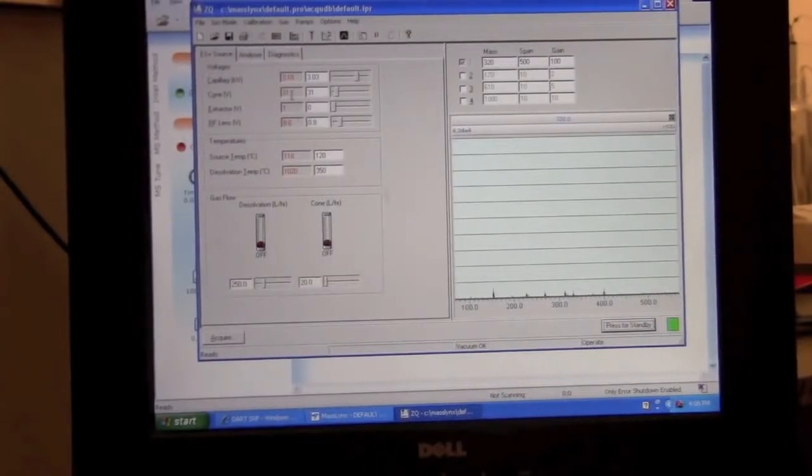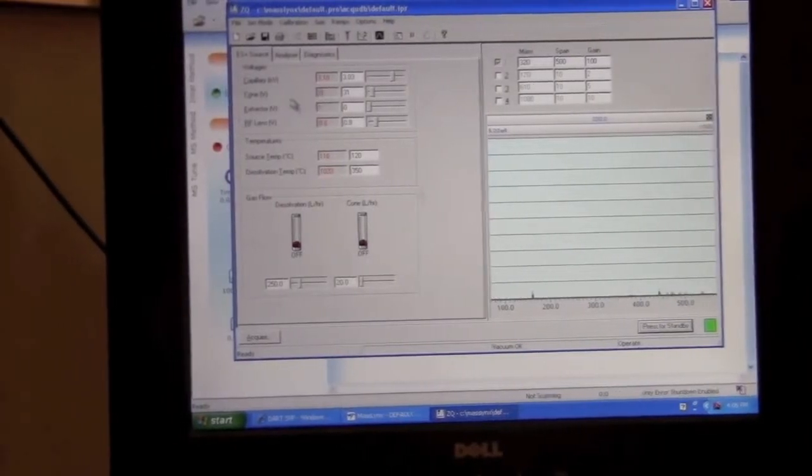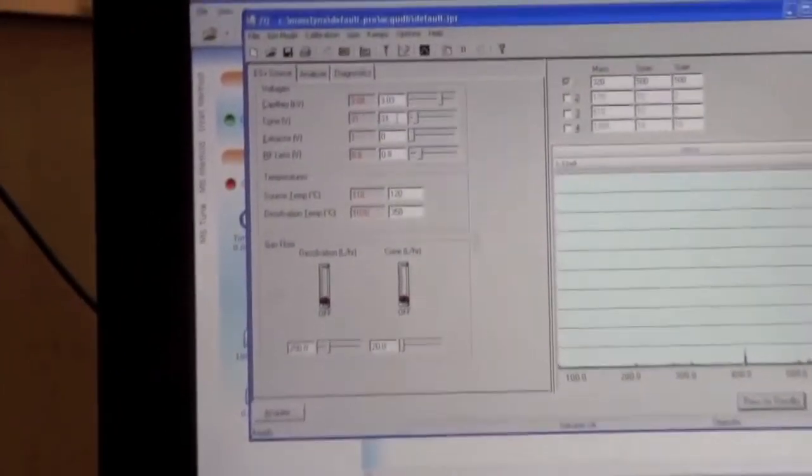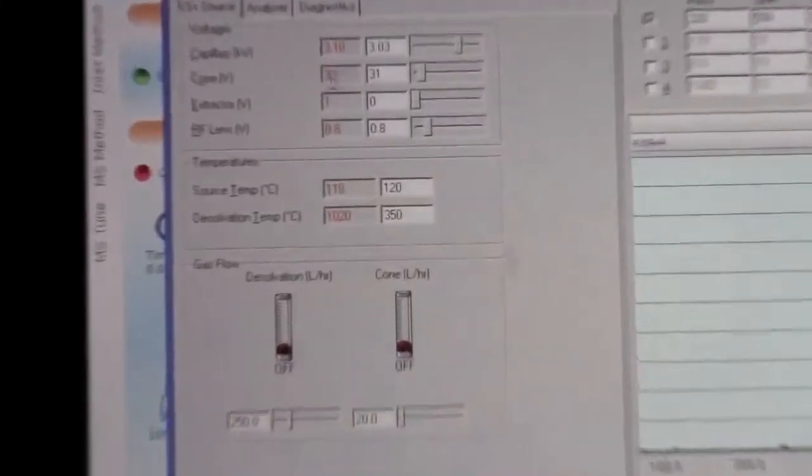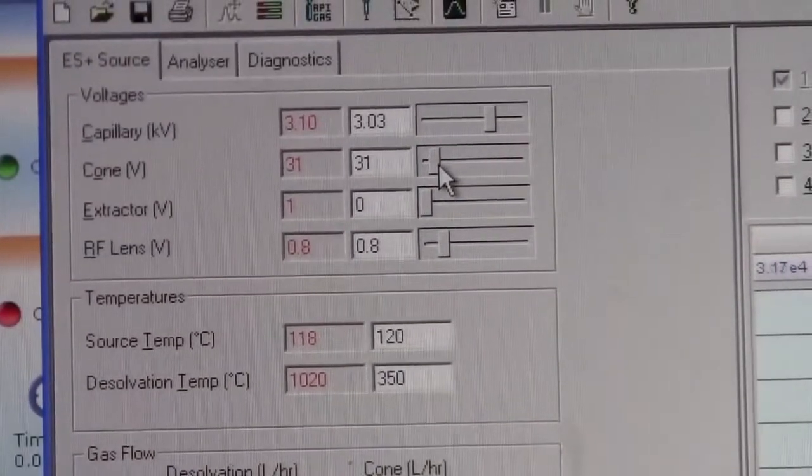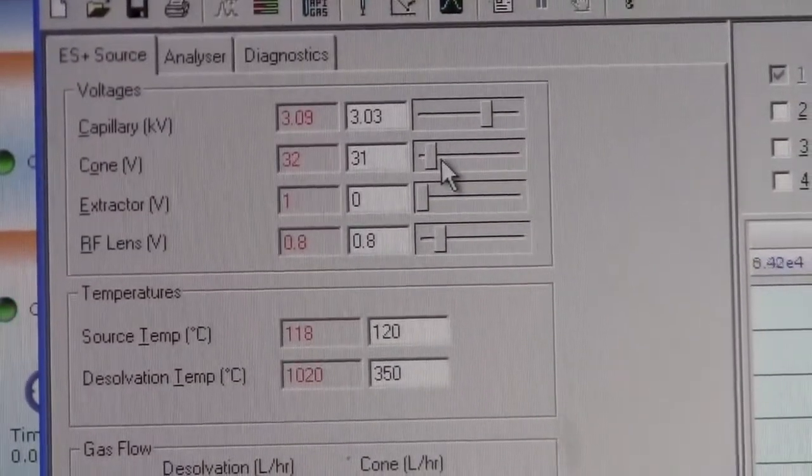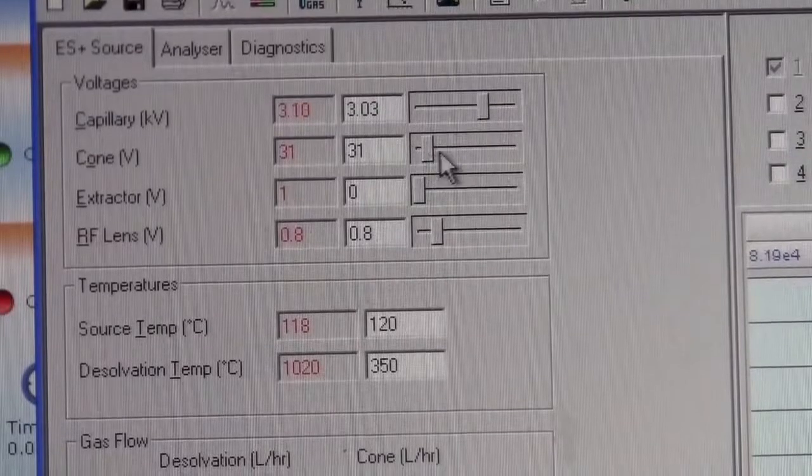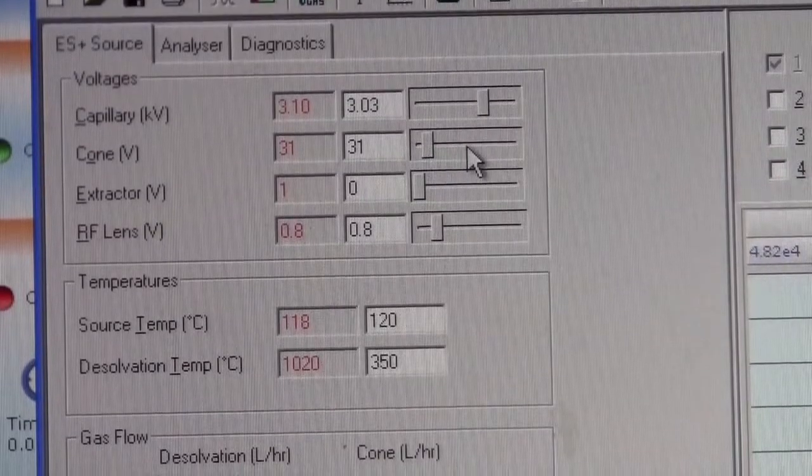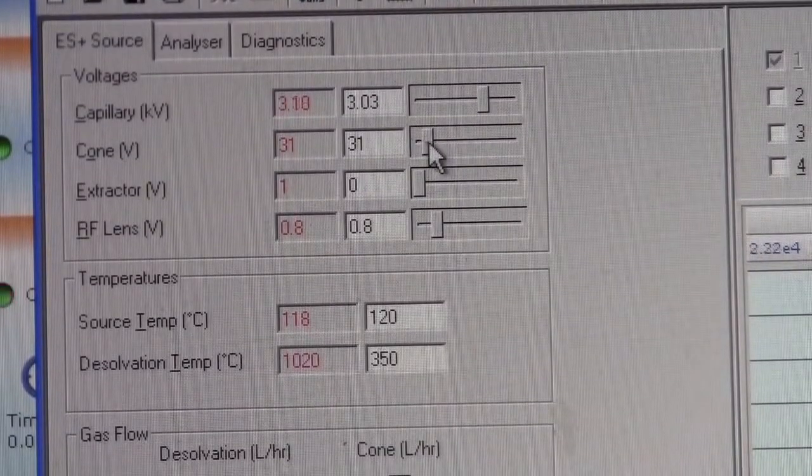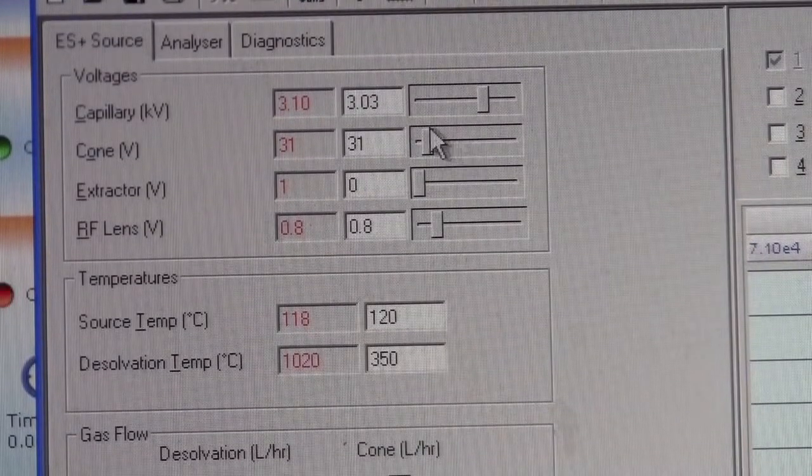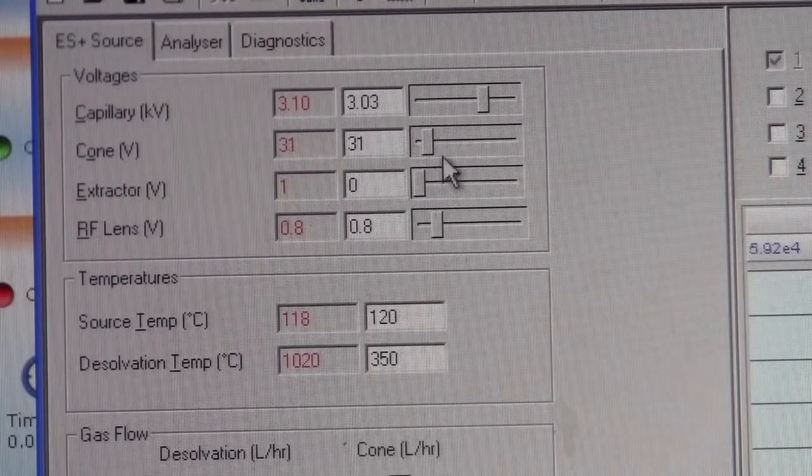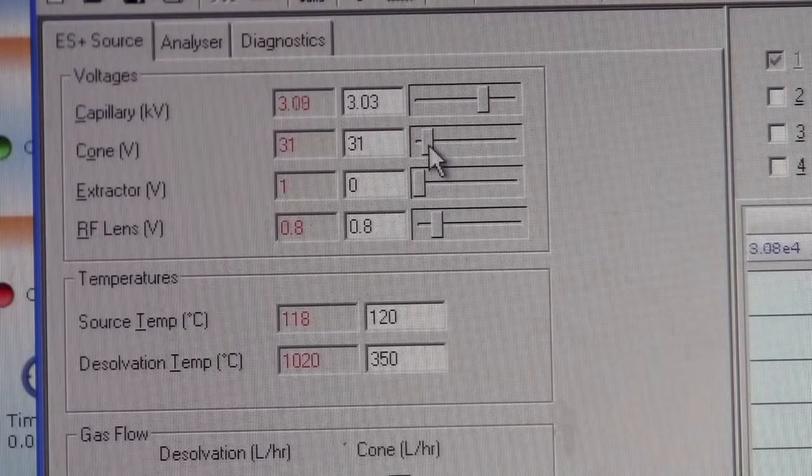The main setting that we want to adjust on this page is the cone voltage. The optimal setting will depend on your sample. Higher is better for some samples. Lower is better for others. I'm going to leave it about 30 volts right now.